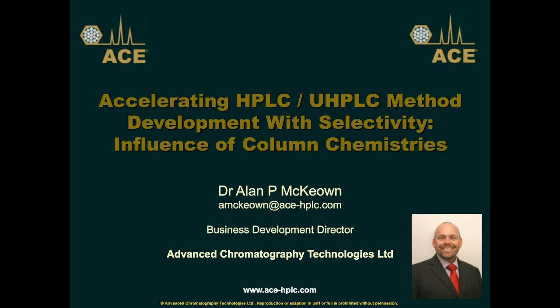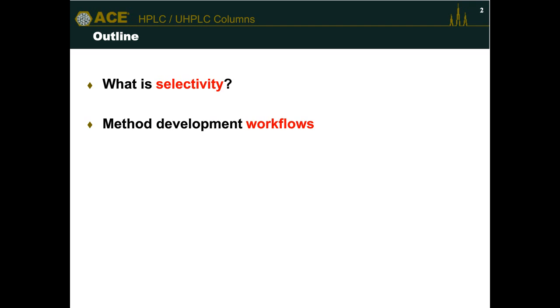So first of all, I'll begin this talk by talking, very briefly, about what I mean by selectivity, just so that we are all familiar with the terms that I will use. Then I will begin to speak a little bit about method development. How do we do method development? What are the options and different approaches that people tend to use in their laboratories?